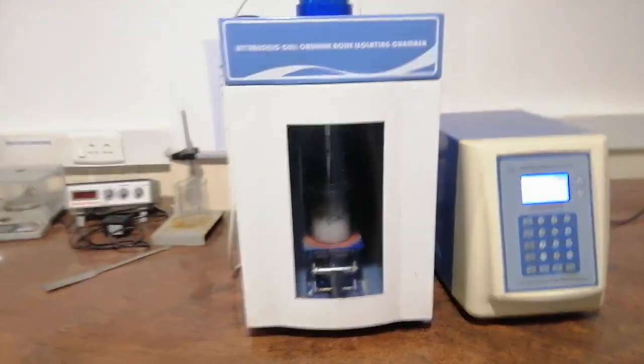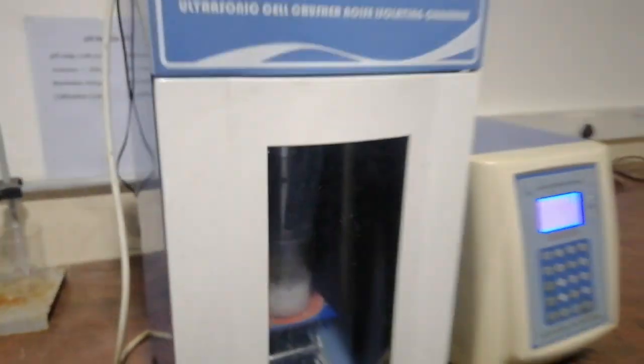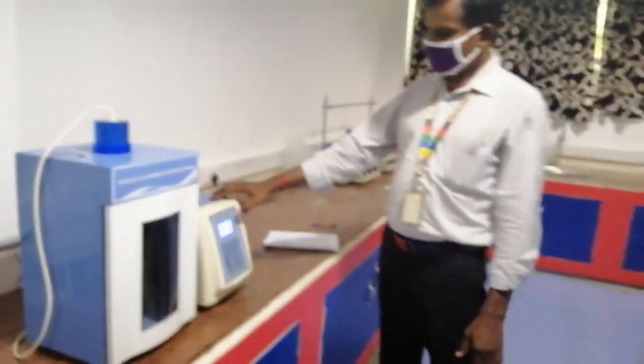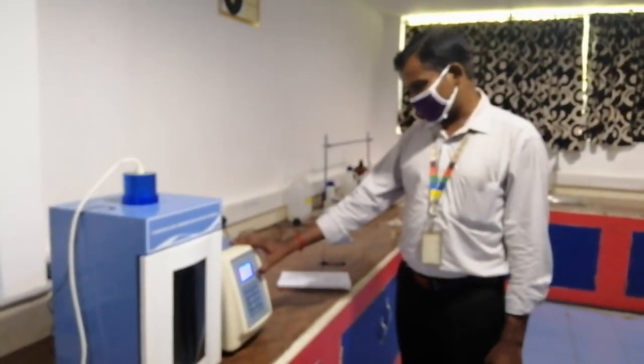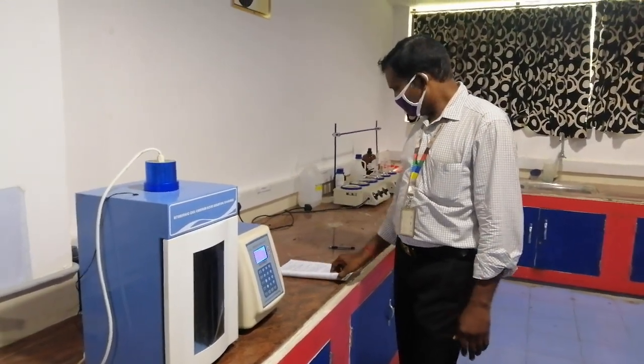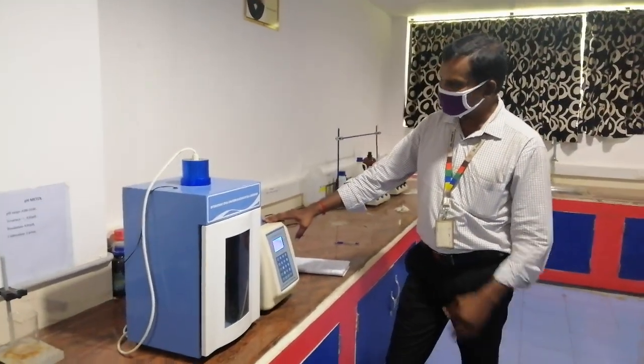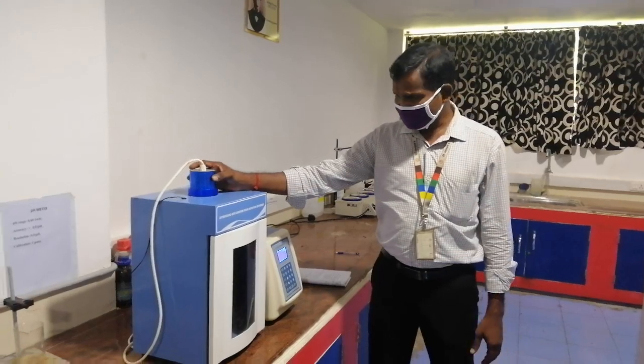So the probe will release the ultrasonic waves to the sample. The ultrasonic wave frequency is about 20 kilohertz. In and around, say, 22 kilohertz, so we have fixed it. To have the ultrasonic waves above 200, here we have fixed the input power supply at 60%. So it will be around 140 to 150 watts. So 140 to 150 watts is given as the input power to your ultrasonic probe.